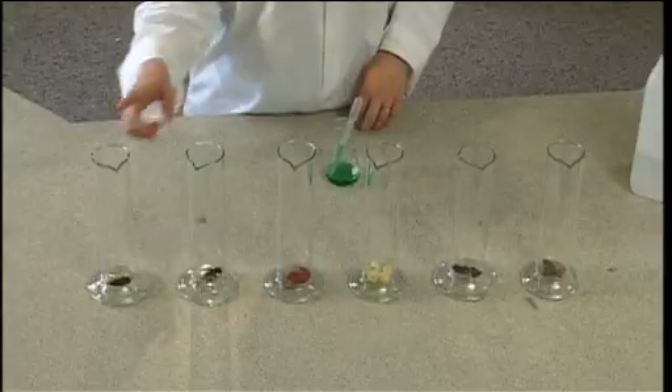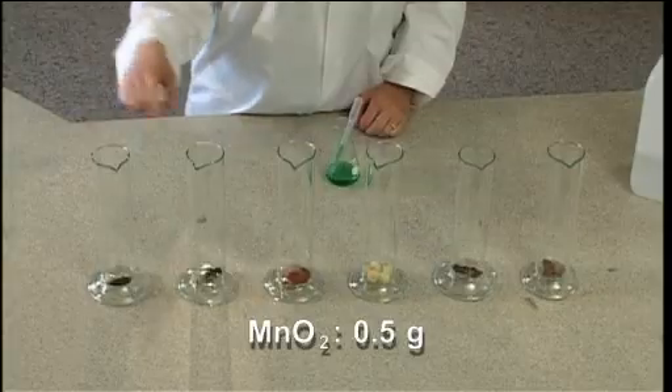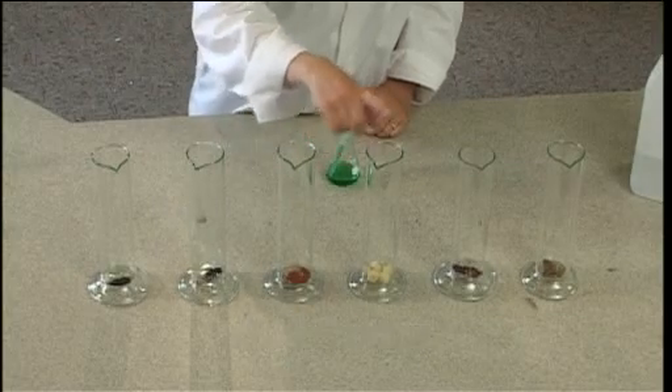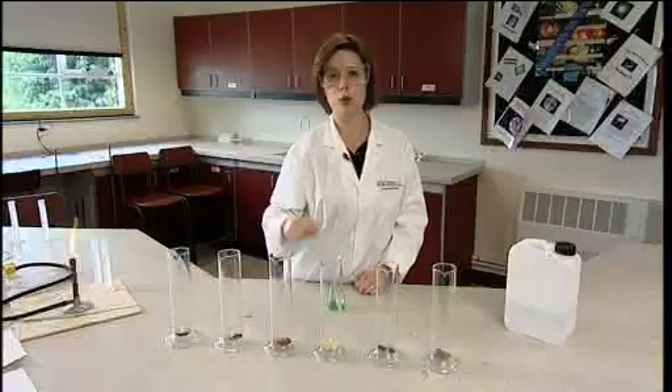Line up six large cylinders and add catalysts to them as follows: half a gram of manganese dioxide, half a gram of lead dioxide, half a gram of iron oxide, a small amount of chopped potato, a small amount of chopped liver, and a small amount of chopped boiled liver.